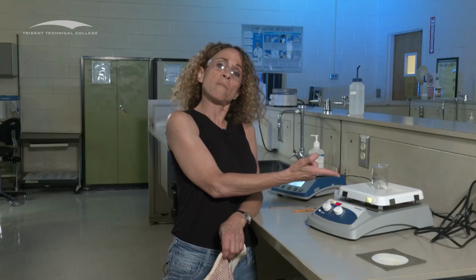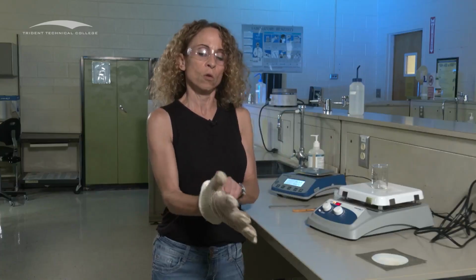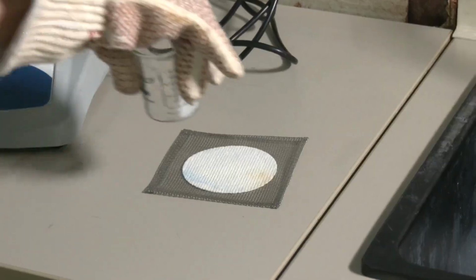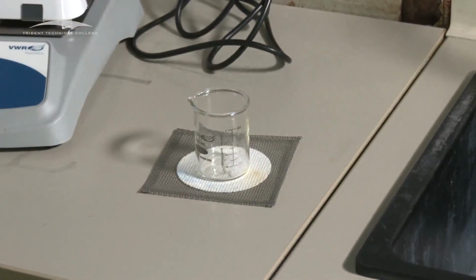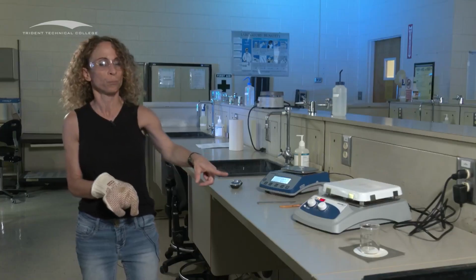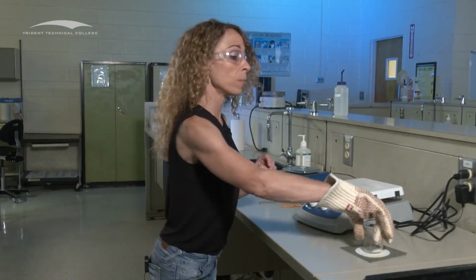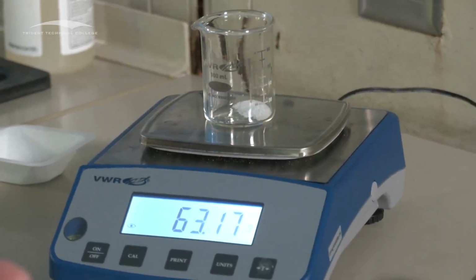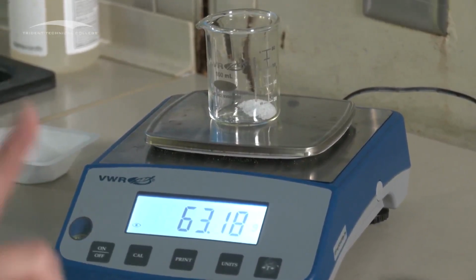Put it on there for 5 minutes, and now are you going to touch it? No, you're not. You're going to put it on your oven mitt, and now are you going to put it on the bench top? No, you're not. You're going to put it on the wire gauze for 5 minutes. Let that thing cool. Now we can put it onto the balance. I'm going to tare this. I'm going to put this on here. There's my weight.